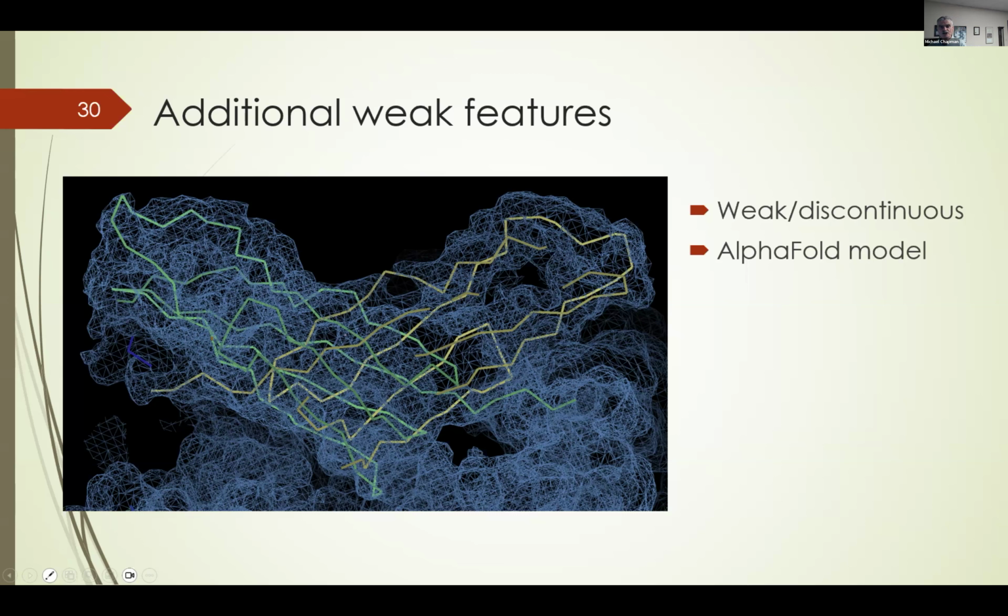And so the peaks are where you've got two structures superimposed. Now, what's emerging here is a very good case for focus classification. However, we'd had several prior attempts at doing a focus reconstruction that had all failed. And so we proceeded with atomic refinement of this superimposed set of two domains and optimized those superimposed domains against the average reconstruction. I doubt whether we could have done this with some of the other refinement methods that were available.